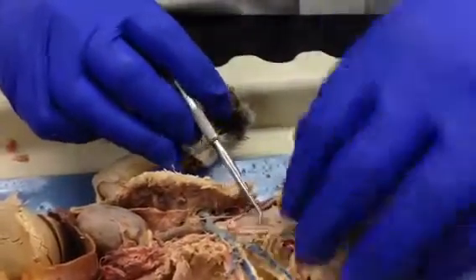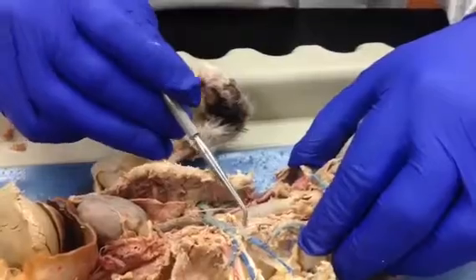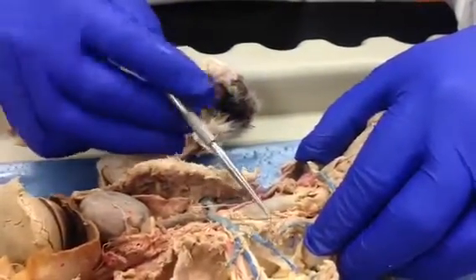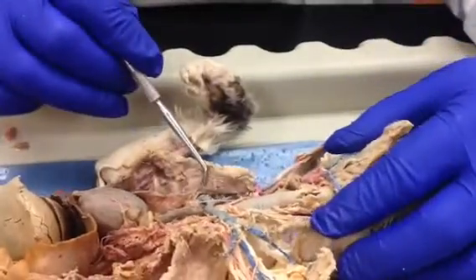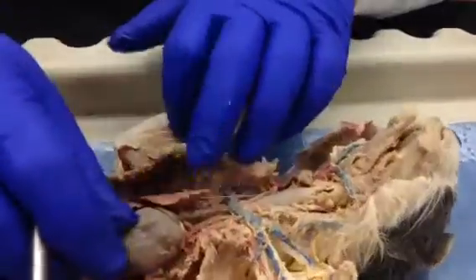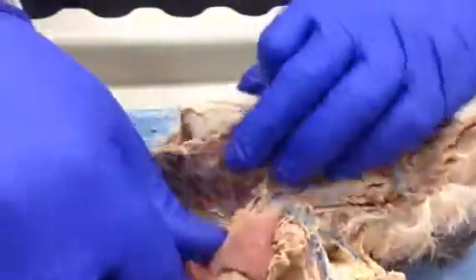Common carotid. Again, the vagus nerve is right along with the carotid. We've done that before, but I'm not sure she might put it on again because it's listed here too. And that's pretty much it for the arteries above the heart. Vein-wise, again, I'm going to tip the heart and the lungs over a little bit.